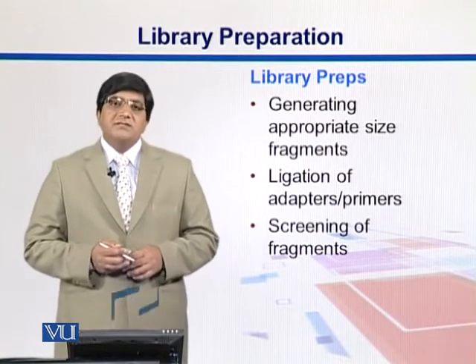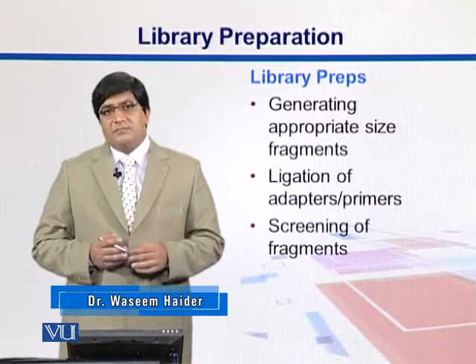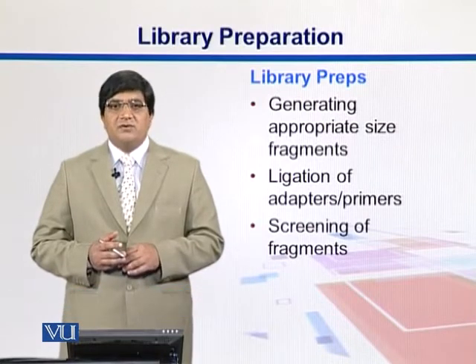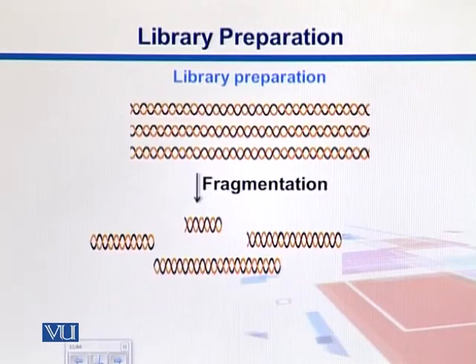Here we generate appropriate size fragments, and then we add primers or adapters, and in the end we screen for those fragments which are good for sequencing. If you look into the workflow, obviously the library preparation is the second phase. Here is an elaboration of library preparation.